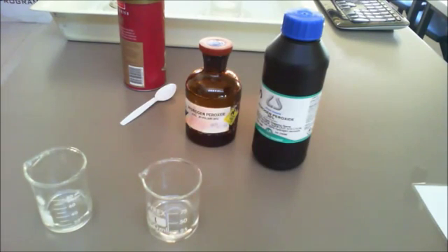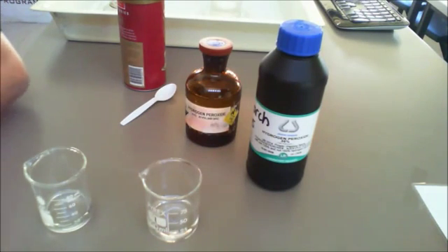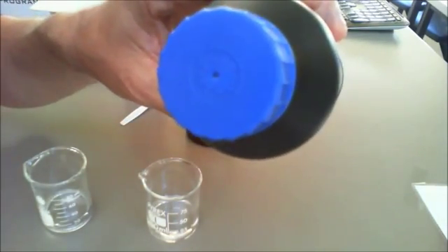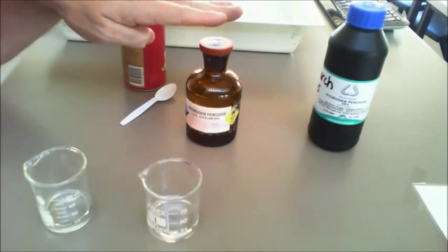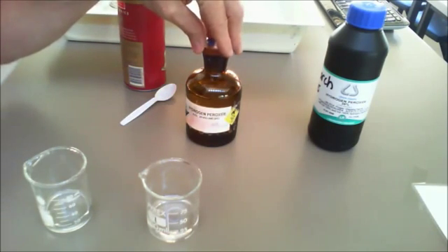Now, the one that we're using today is a fairly common one, which is hydrogen peroxide. Hydrogen peroxide has the chemical formula H2O2, and it will naturally break down to water and oxygen gas if you leave it alone. That's the reason the bottle that we keep it in has to have a vent to allow the oxygen to escape. When we use it within the laboratory, we put it into one of these beakers or reagent bottles, and then we store it in the fridge.